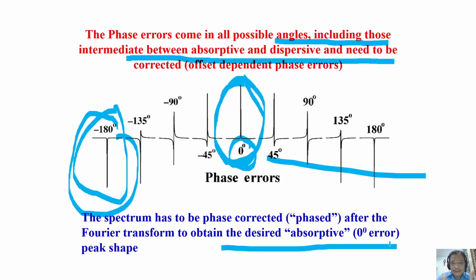I said you will get that many frequencies in the frequency domain, because Fourier transformation is a linear process. I also gave many examples of how phase errors can come and what will happen to the Fourier transformation for different types of functions. Many things we discussed today. We'll continue our discussion tomorrow on processing of the data.